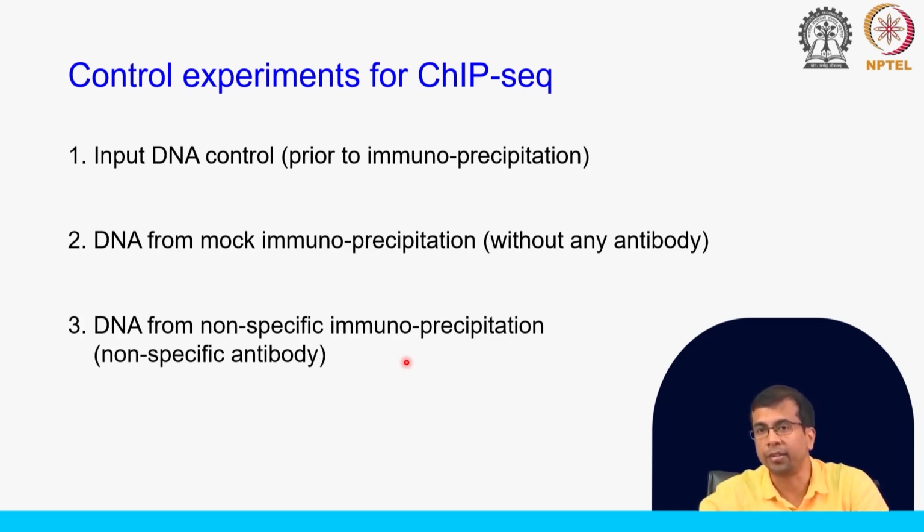When you do next generation sequencing experiments, we have this variation in read coverage or read depth across the genome, and to distinguish these random fluctuations from an actual peak, we need to do an enrichment analysis. So, we do the enrichment analysis from the sample, our treatment, versus an input control. All experimental data that we will be looking at will have a control, and usually that is the input DNA control.